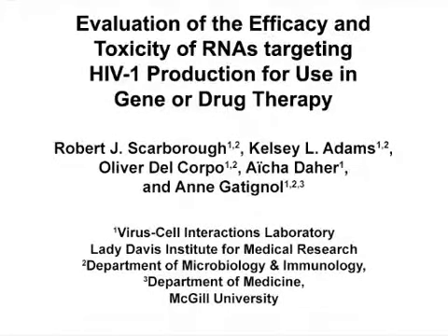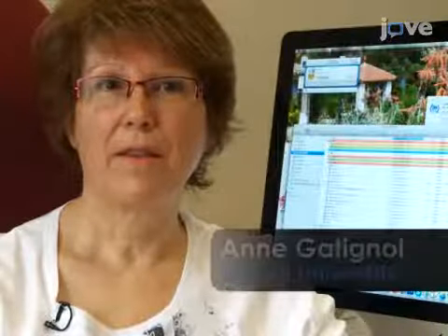The overall goal of this procedure is to compare the efficacy and toxicity of new RNAs targeting HIV-1 production. This method can help identify new RNA molecules for use in HIV-1 gene or drug therapy, such as short hairpin or small interfering RNAs, ribozymes, and RNA decoys.